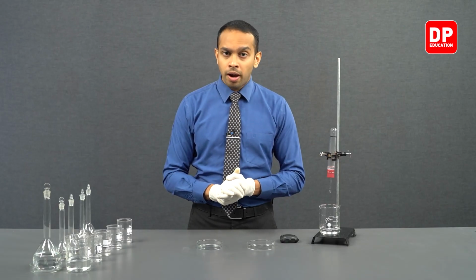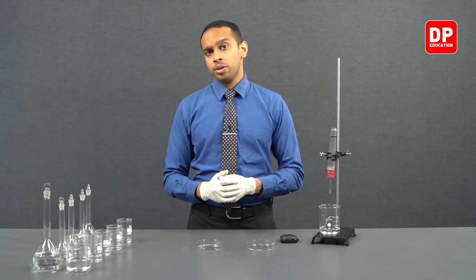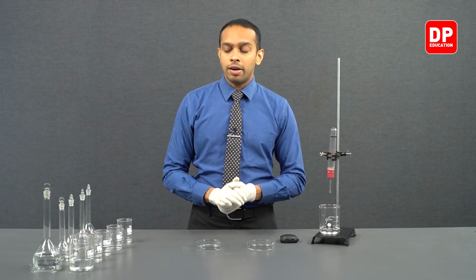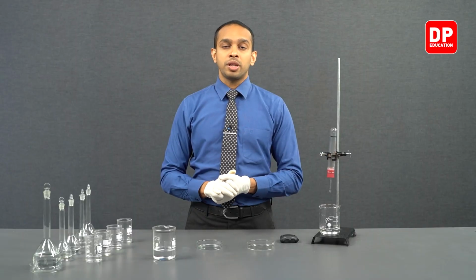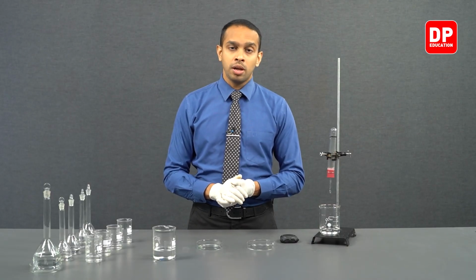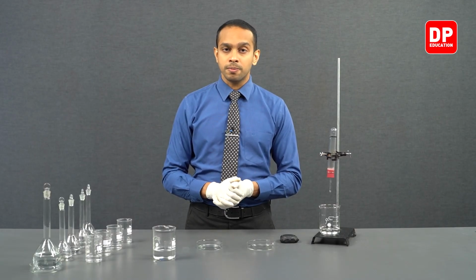Now let's move on to the final reaction, where we are going to be reacting the magnesium strip with HCl solution that has 1 mole per decimeter cubed concentration. So we have a 1.0 mole per decimeter cubed concentrated HCl solution here, and we are going to now react the magnesium strip with this solution and observe how fast the reaction is taking place.